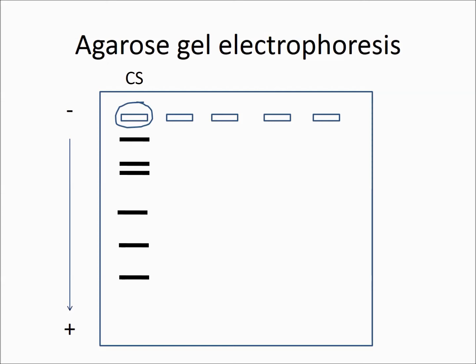The procedure is repeated for the victim's DNA, that is, the victim's DNA is amplified, and then target sequences are separated by agarose gel electrophoresis, and you might obtain the following pattern. So clearly the crime scene DNA is different from that of the victim, so it might correspond to a suspect.